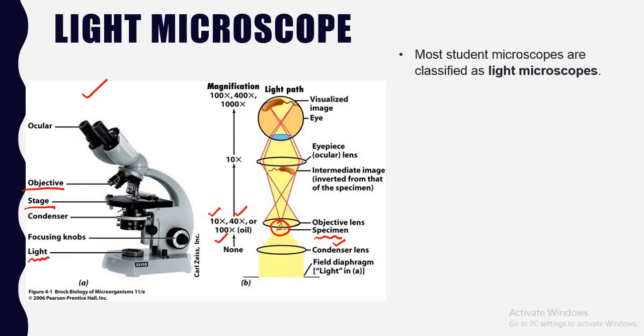And the magnification and how the image gets magnified, we have already discussed in detail in the first part. So if you haven't checked part 1 of the microscopy, please go and kindly see that video first. You will see how the image gets magnified. Objective lenses are of 3 types. Also, the use of the oil, we have discussed there. So kindly check that.